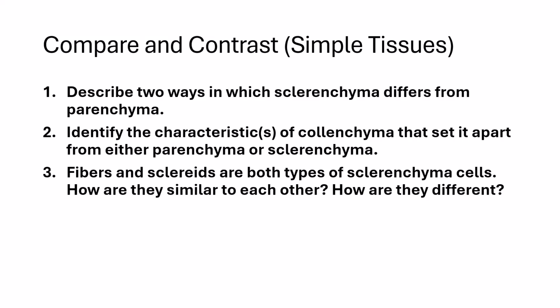Fibers and sclereids are both types of sclerenchyma cells. How are they similar to each other? How are they different? Think about the shape, location, and function. Pause and record your responses.